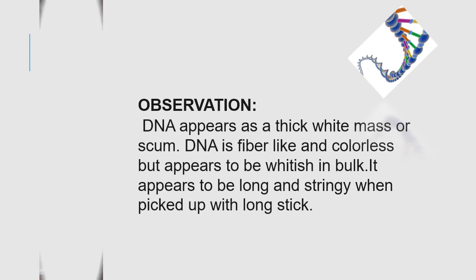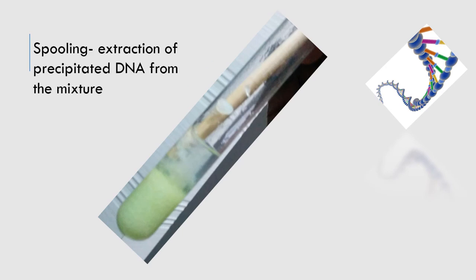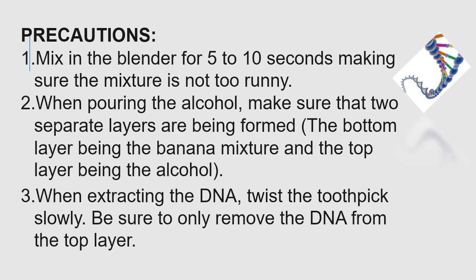Now you are going to use the chilled ethanol, which you will pour gently down the side of the narrow glass or tube if you have it. You will see the DNA as a cloudy precipitate separating out from the banana mixture. The precautions are quite simple to follow.